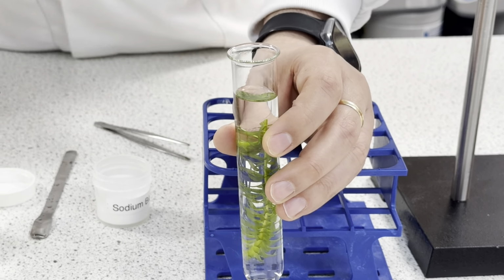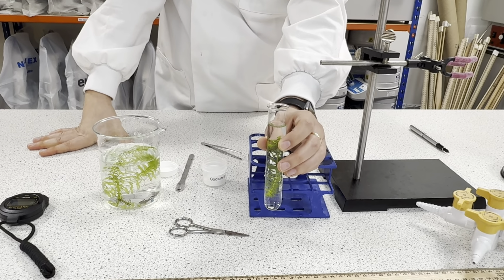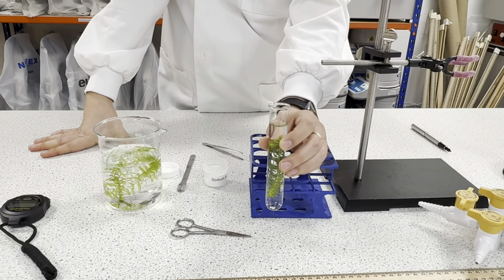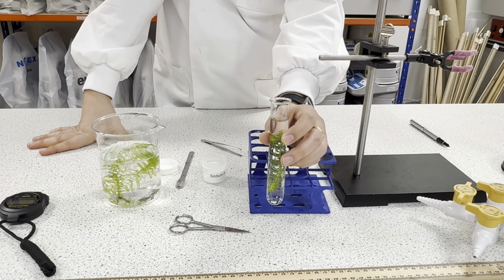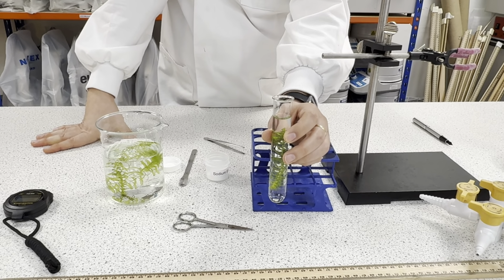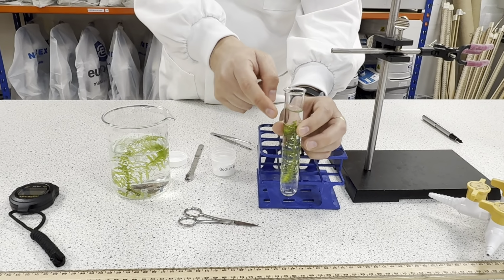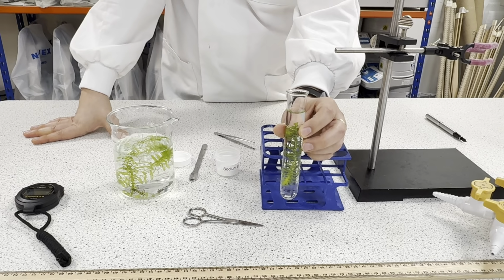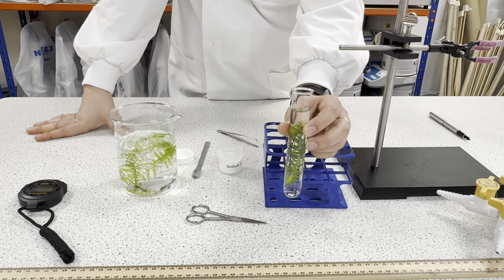Why? As soon as I cut the pond weed from the fish tank, it starts to seal the cut. Depending on how long you keep it outside, it will be completely sealed. So it's always good to give a little cut, but completely submerged. So then you don't have any air blocking the xylem in the plant.